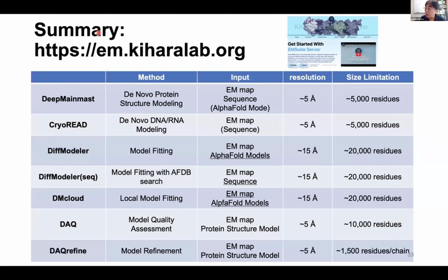Okay, you asked about the ligands, right? Ligand modeling, we are also in the process of developing ligand modeling methods. But ligand modeling is more difficult. Actually, the data set is even doubtful sometimes, because if you look at the PDB entry, you see the ligands are not really fitting to the map.